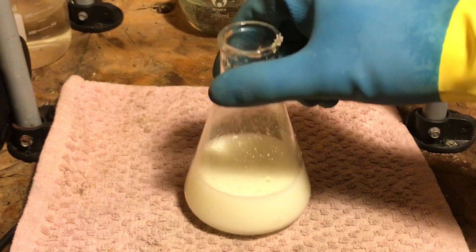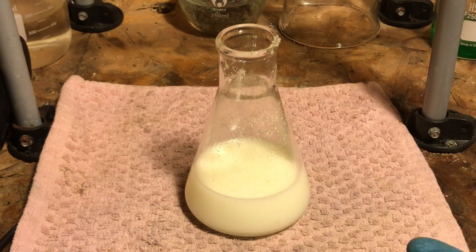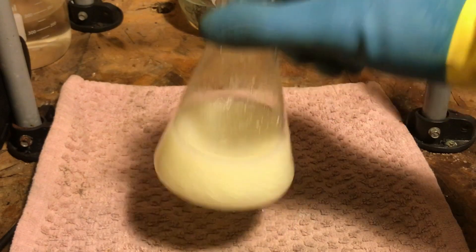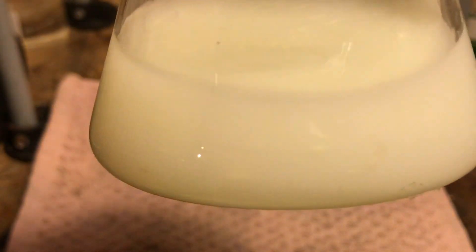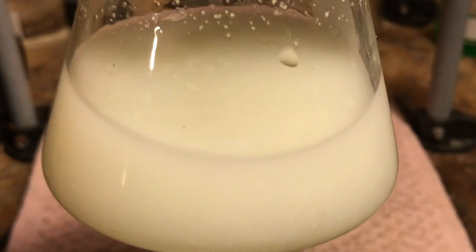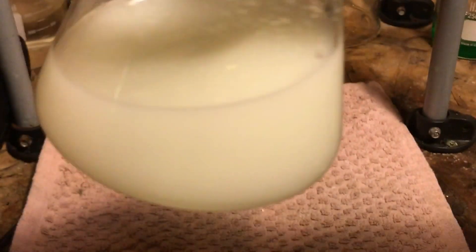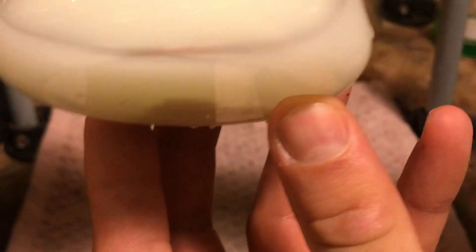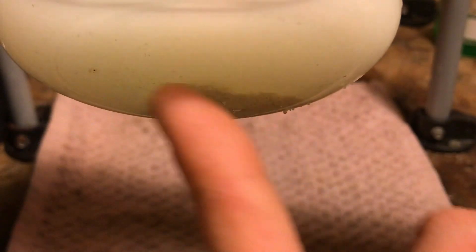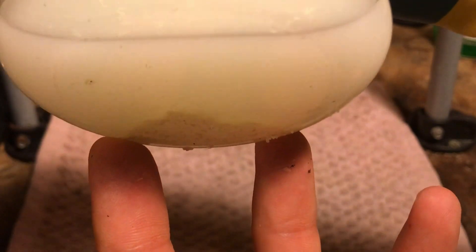I'm going to allow the solution to settle, allow all the precipitate to go to the bottom of the flask. As you can see, if you look very closely, you can see precipitate of the silver bromide in the flask. It should be near the bottom. What you're seeing here is the silver bromide precipitate.